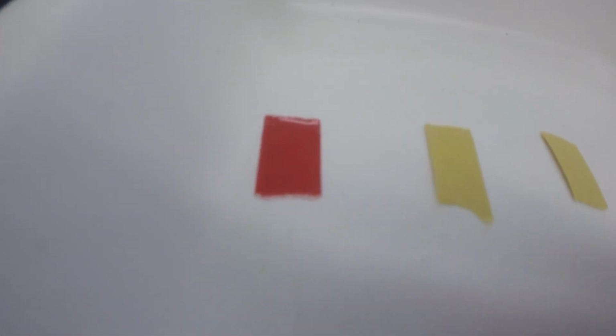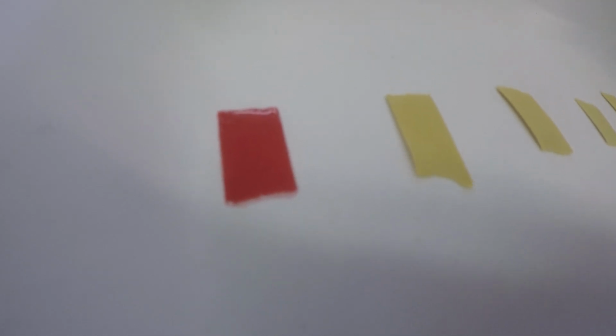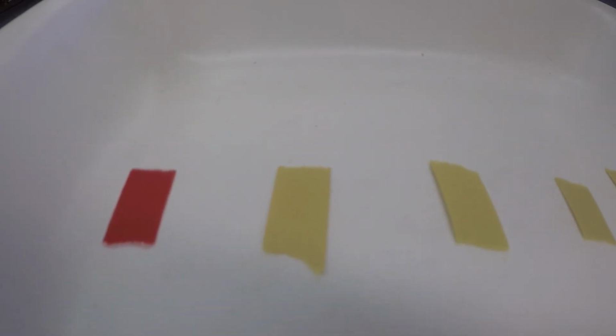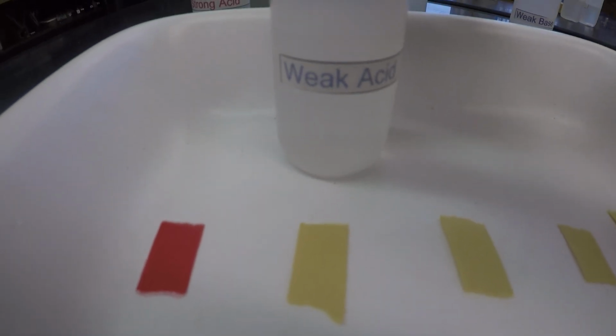I tried to put this on a piece of white so that you could see it better. All you have to tell me is what color that is, and I'm not going to grade based on, oh no, that's not the color I think it is. Second one, I've got weak acid.